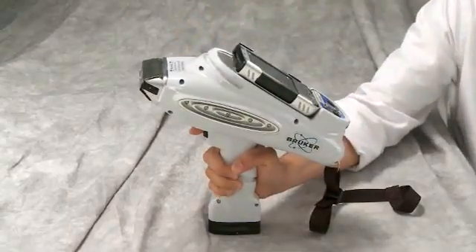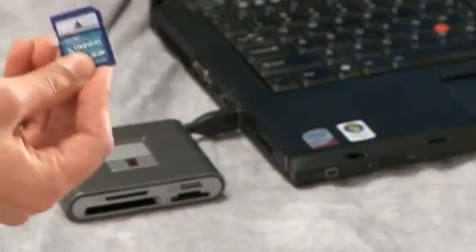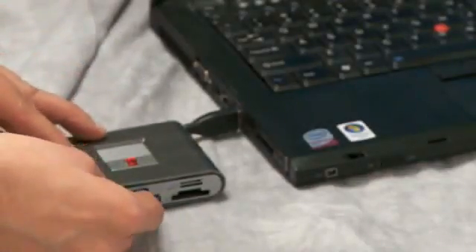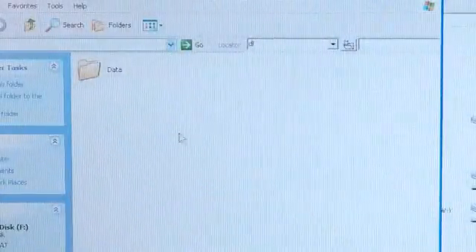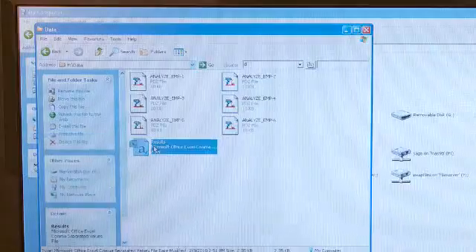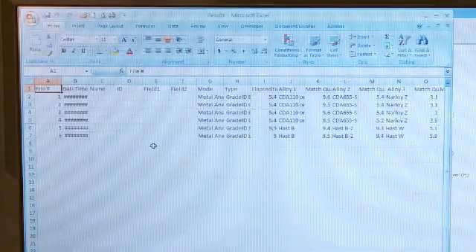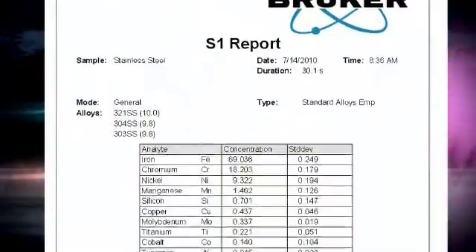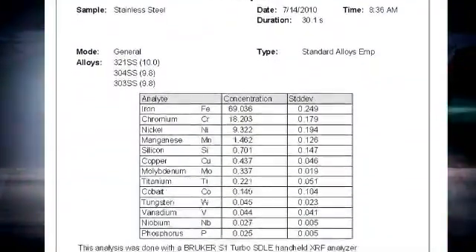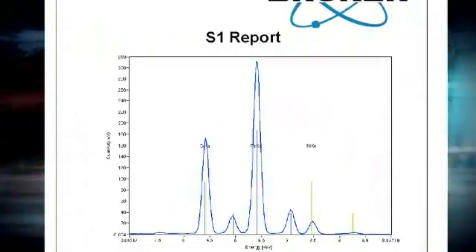Once the data has been transferred to the SD card, remove the SD card from the PDA and insert it into your PC using the USB card reader supplied with the analyzer. You will find a directory called data and a file in that directory labeled results.csv. You can open this directly from the card reader or transfer the file to your computer. If you double-click the results.csv file, it will be opened in Excel and you can view the data. The optional S1 data tool can be used to open the results.csv file, view the results, and create carefully formatted reports for each sample which was analyzed.